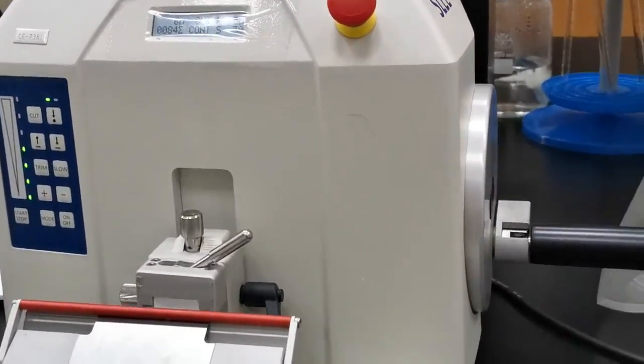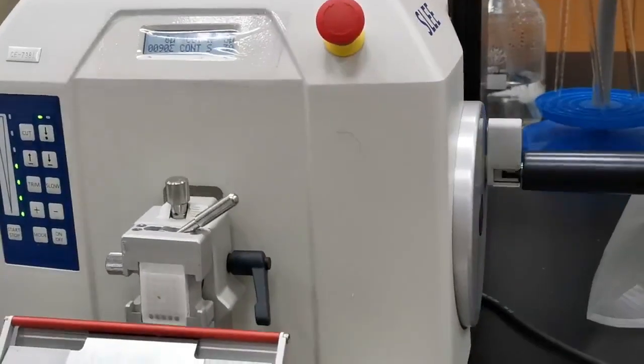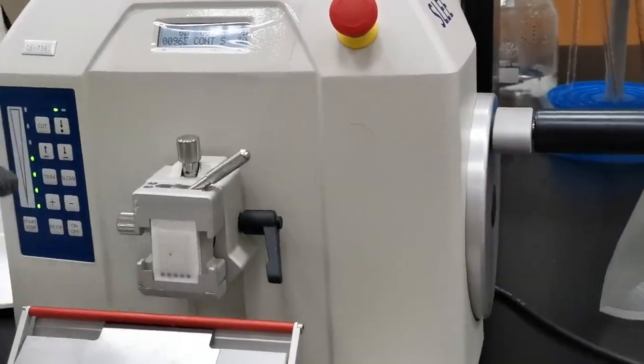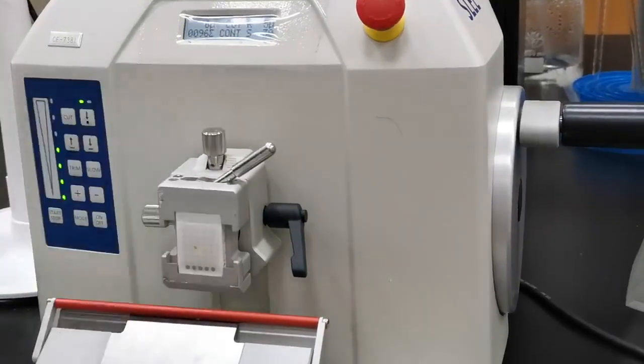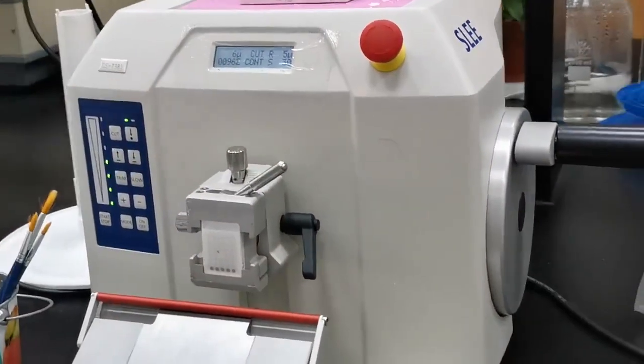This covers the electronic control of the microtome. Once you stop it, it will make a full move back to the last position, which is the default. Now we know how this machine works.